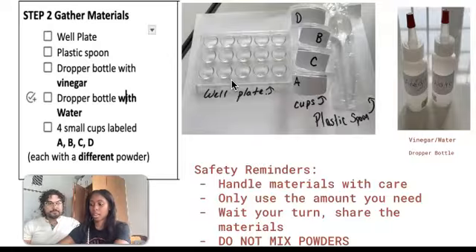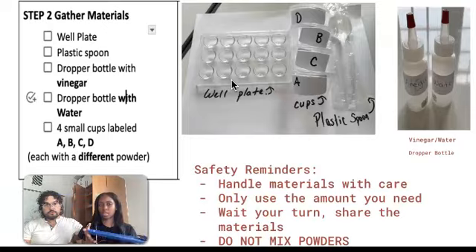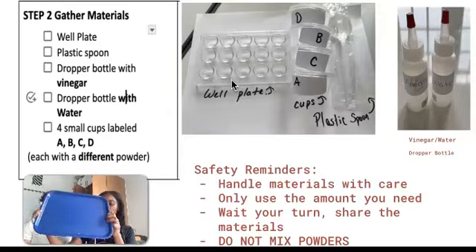And last thing that we want to make sure that we do, you want to grab a tray to do your experiment on. This is to keep things clean. It's not on the checklist, but you need to make sure you grab one.